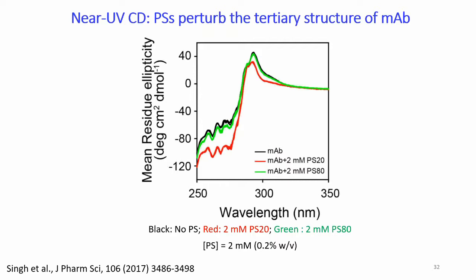possible. And we were able to record the circular dichroism spectrum of proteins as low as 170 nanometers using Chirascan Plus. But playing with the buffer conditions, the protein concentration, and the path length of the cuvette may work. You have to optimize the buffer system, the cuvette, and the wavelengths a little bit.